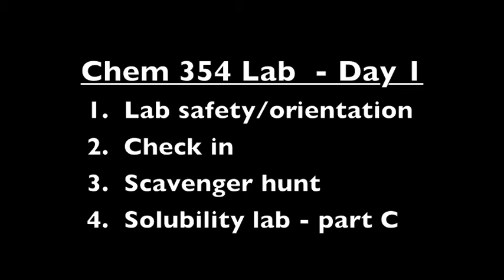Then you're going to do a scavenger hunt, where basically you look around the lab, you get oriented with the lab, you find the things that you need to find. And lastly, we're going to do a really quick experiment, solubility, which is experiment 2 in your textbook. And we're just going to be doing part C on day one. So I'll show you what that looks like.